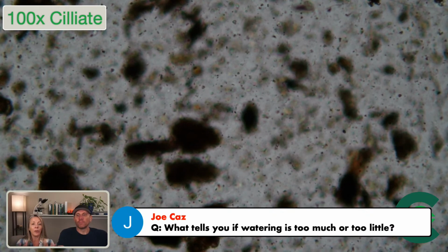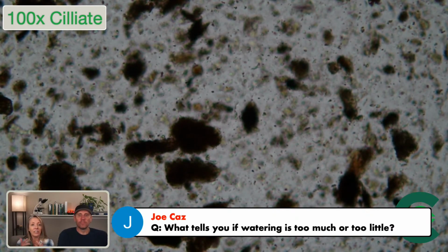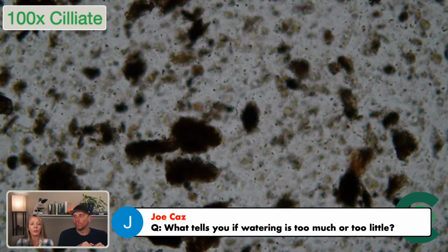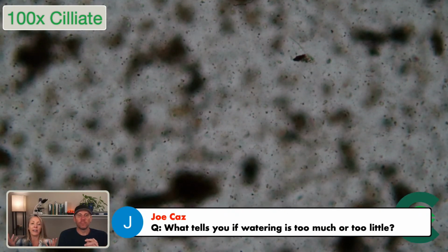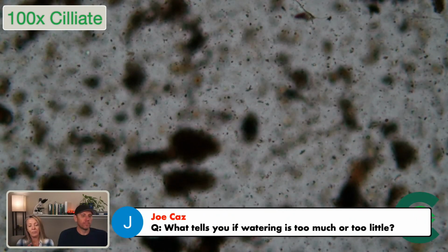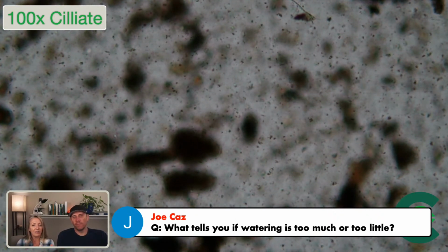This is part of the way that we identify organisms, by the way that they move. You'll see this movement in ciliates often. Sometimes they can move slower, but usually they'll move that quickly. If I were to zoom in at 400x, he'd move right out of my field of view. It's so small, I would capture maybe a little bit, and it'd be very dizzying. So that's why I took it at this level of magnification.